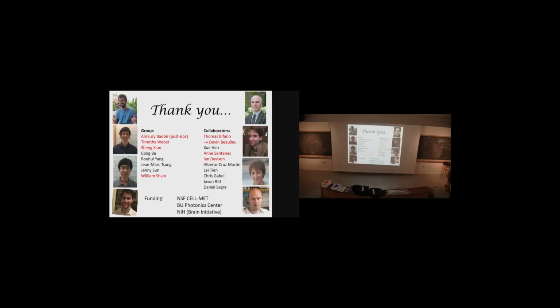So where do we want to go? Well, again, I told you at the very beginning that ideally we'd like to have a low repetition rate laser that's high power. That's not what we had. Unfortunately, we had a high repetition rate laser that's low power. So we had to artificially reduce the repetition rate of our laser. It was a big mess. Ideally, we'd like to go to 3-photon microscopy, to go very, very deep, because 3-photon microscope lasers are intrinsically low repetition rate. And that's it.